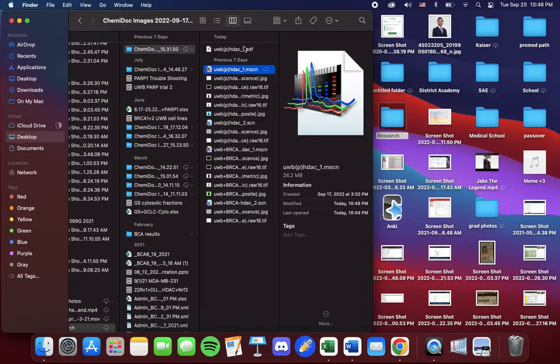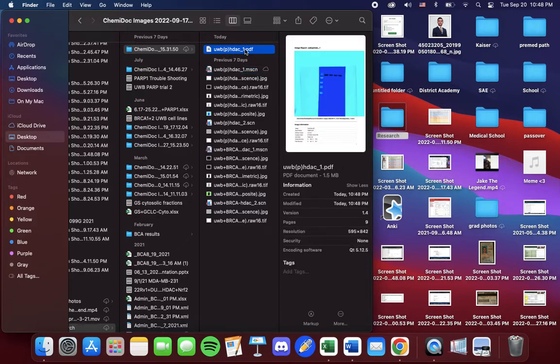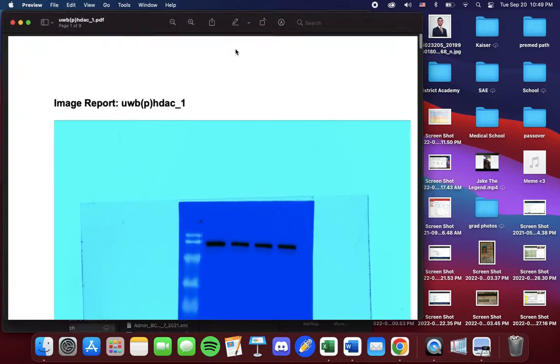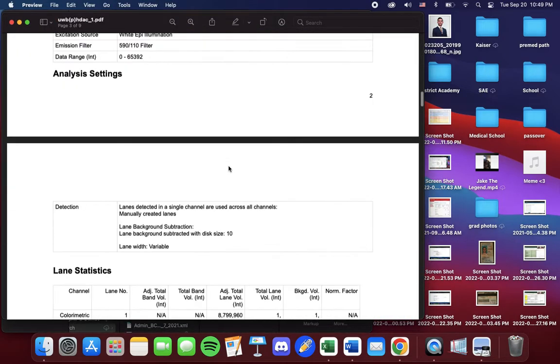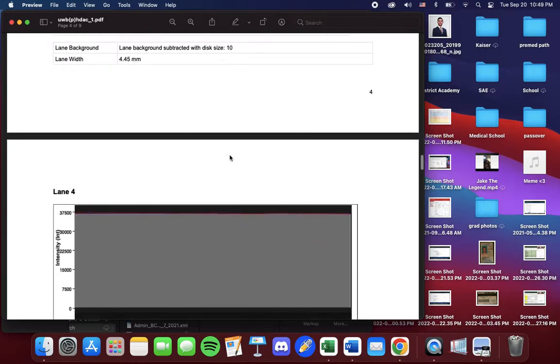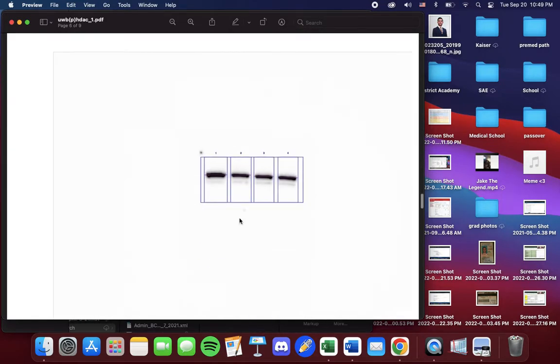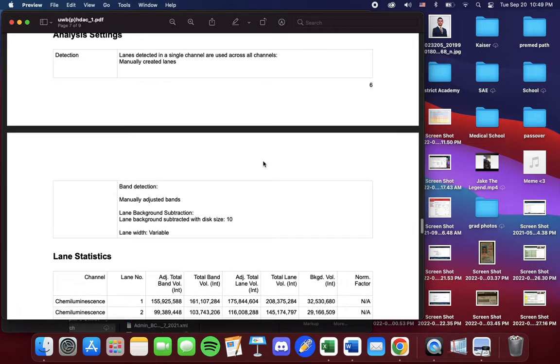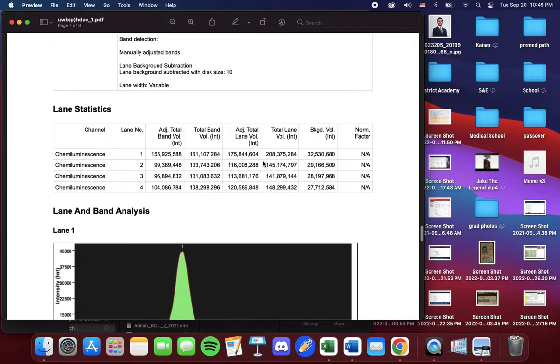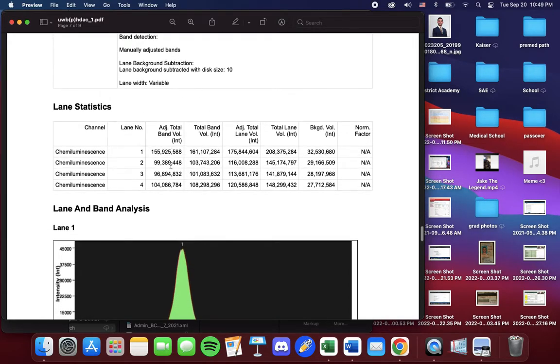Now at the top, we see our PDF. If you open it up, we will scroll down again. Under chemiluminescence, we see our blot right here. And here is the lane statistics.